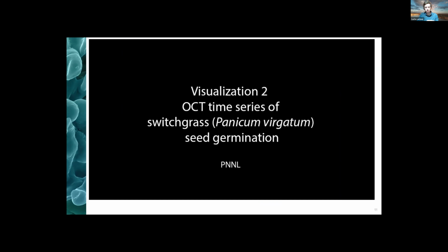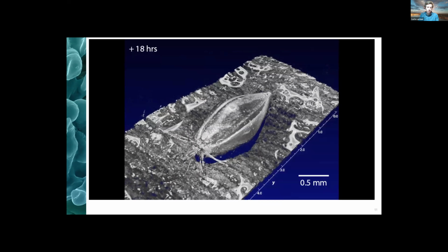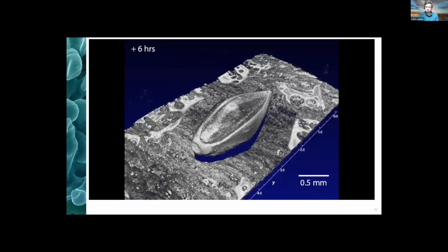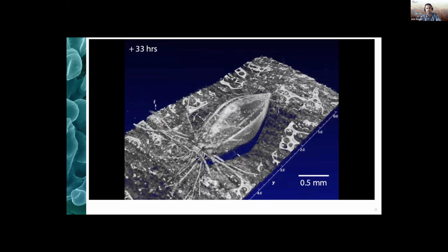And then, of course, it also just takes nice, good pictures that can go into publications and whatnot to provide some visual support to other measurements that are done. Awesome. Yeah, I also see lots of potential in using this to complement many other capabilities that we have, and as you just mentioned, one example is to work with you. Yeah.